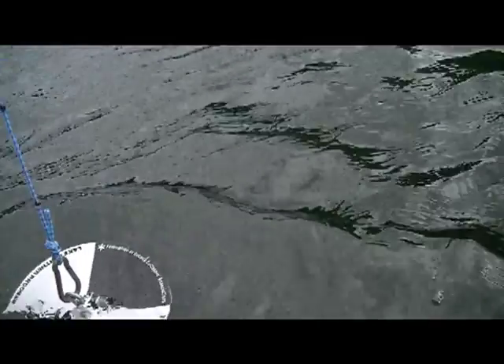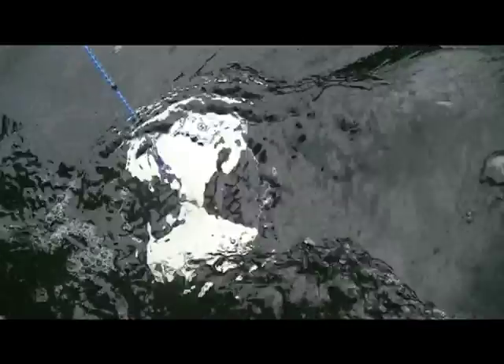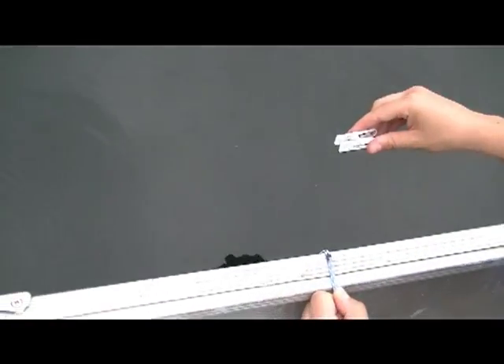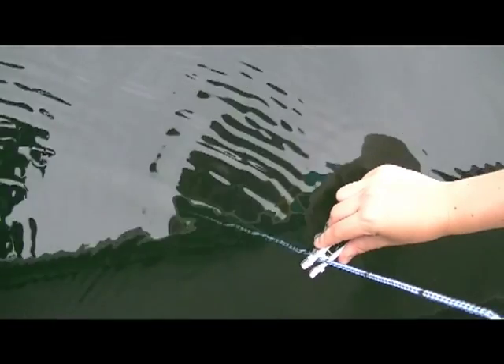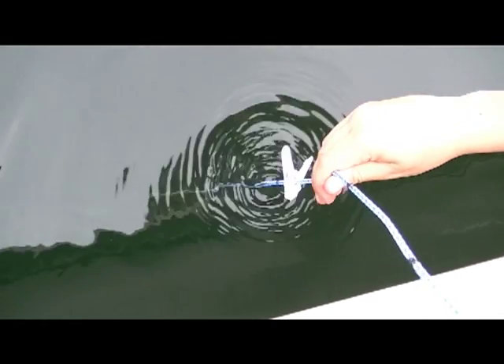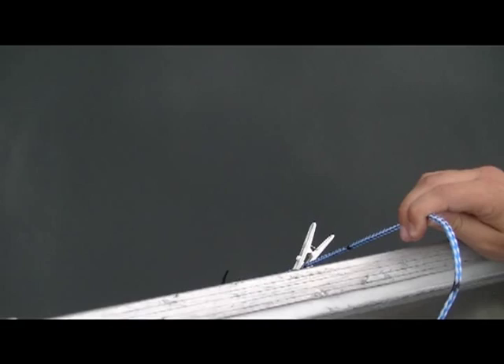To do this, lower the Secchi disc into the water making sure the line is straight. Record the depth at which it disappears by attaching one of your clothespins at the water's surface — that's reading A. Slowly raise the disc and record the depth at which it reappears and attach the second clothespin — that's reading B. Average the two readings using the formula A plus B divided by 2. The result is your Secchi disc, or water clarity, reading. You can repeat the exercise in order to validate your results.